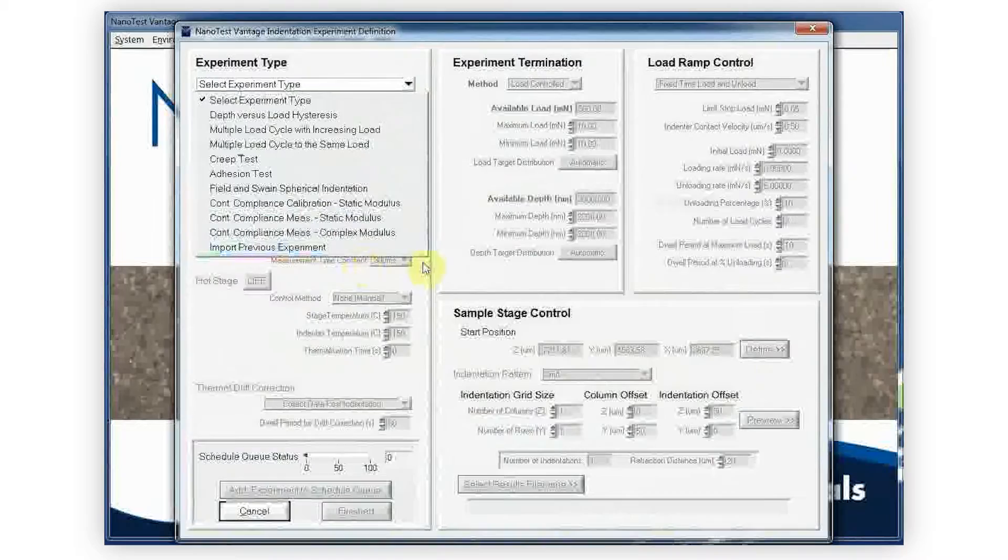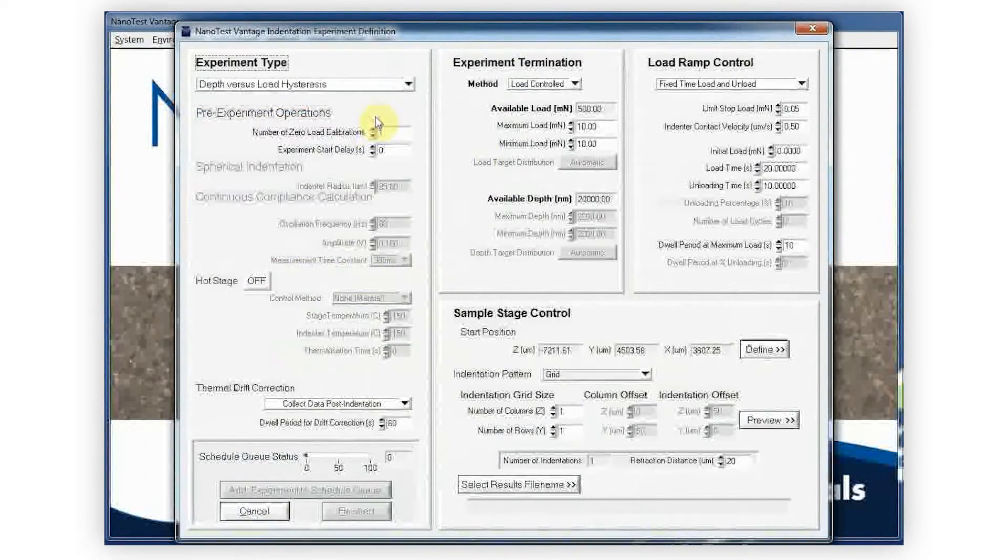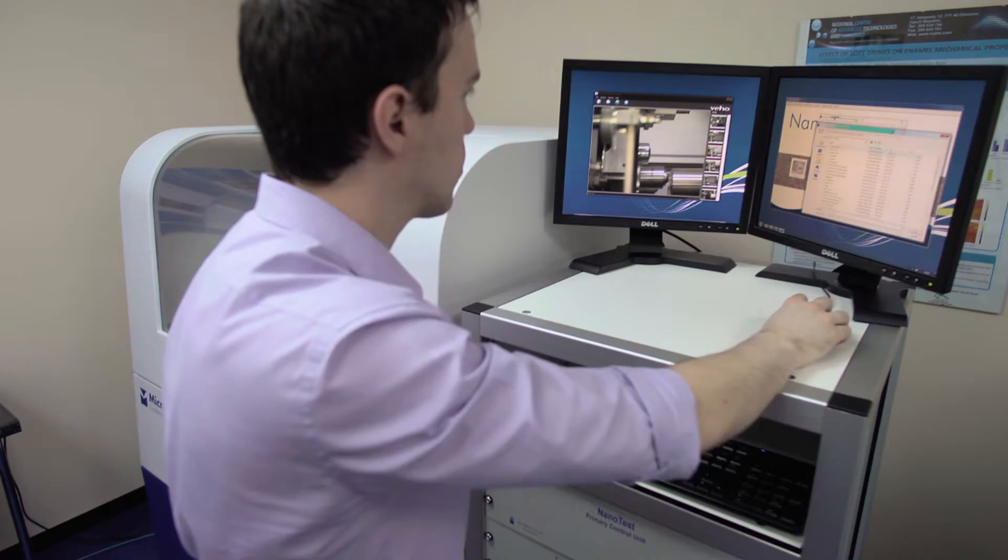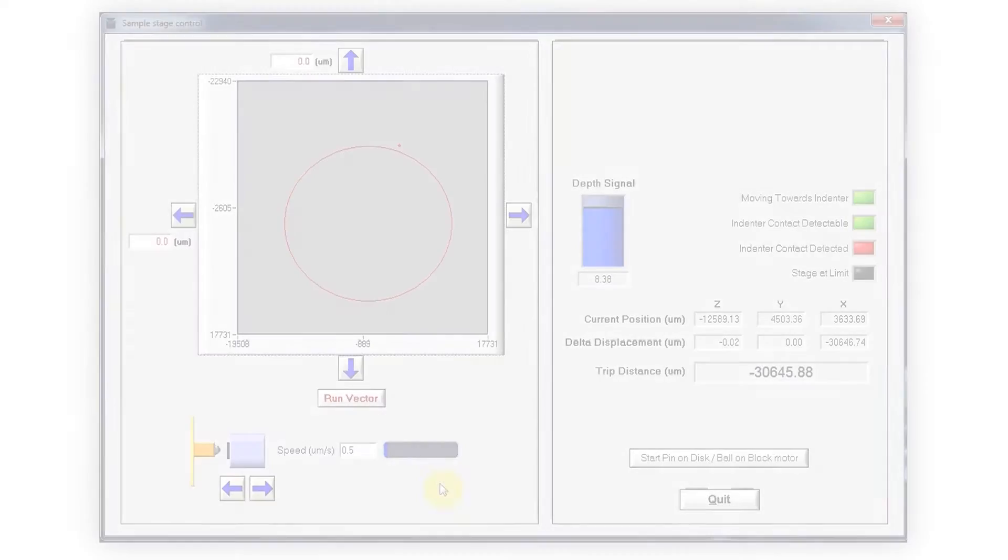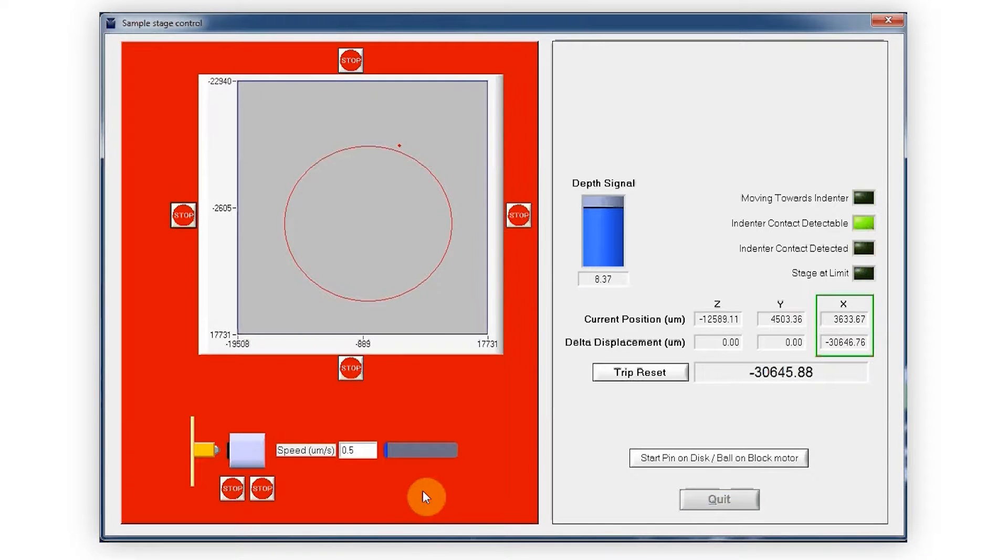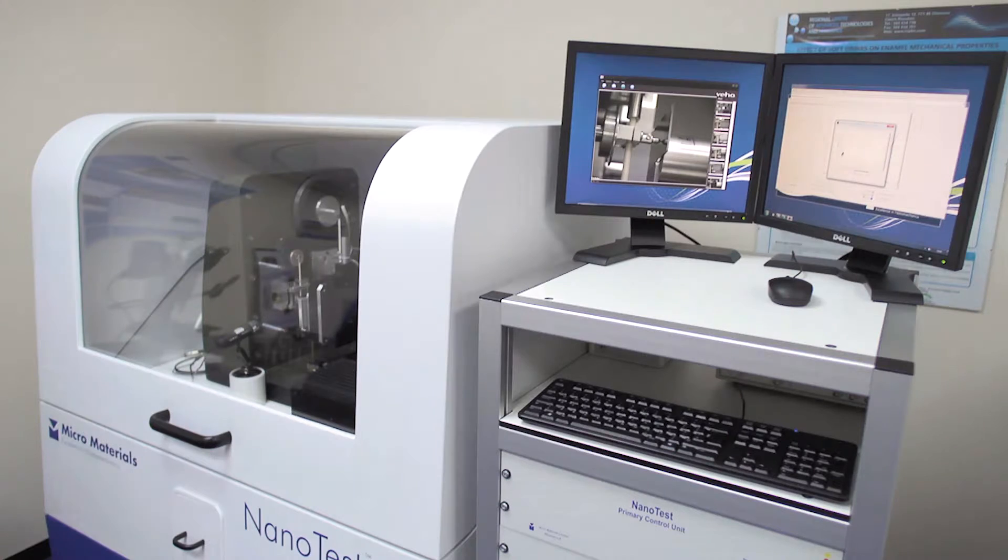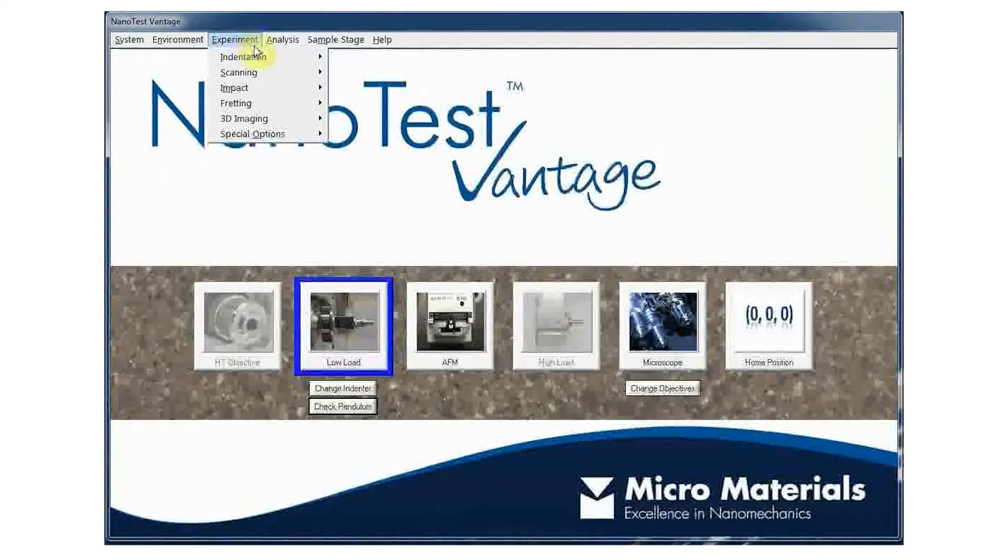Improvements brought by the NanoTest Vantage have focused on four key areas: improved ease of use, increased speed of setup, calibration and training, improved system performance and system robustness. Multiple samples can be tested simultaneously, and the software scheduling system allows the instrument to run 24-7 without user intervention.